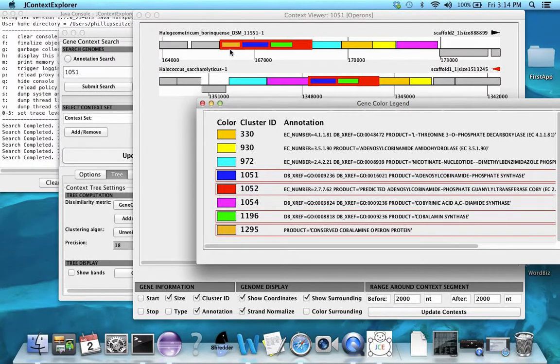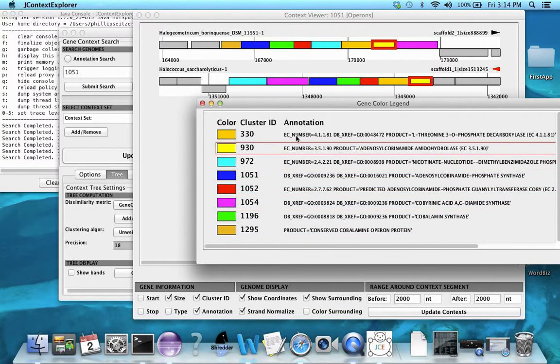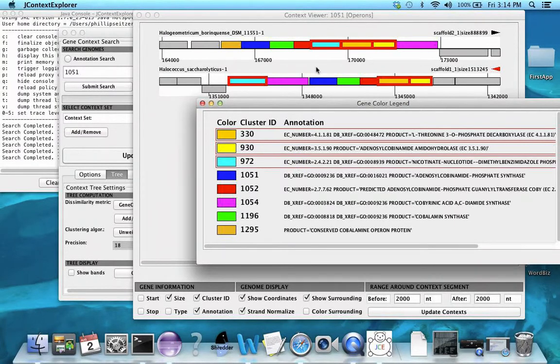You see these 4 genes are all collinear here, but now there's a big change. I can do a similar thing here and see how in this case these 3 are together and now there's this huge separation. So clearly the genes have changed in their ordering, not so much in their content, just in their ordering.